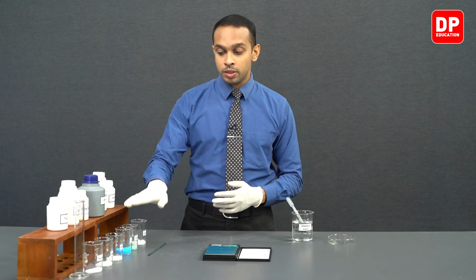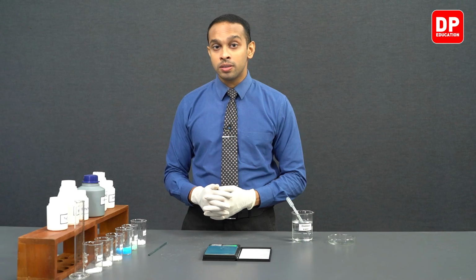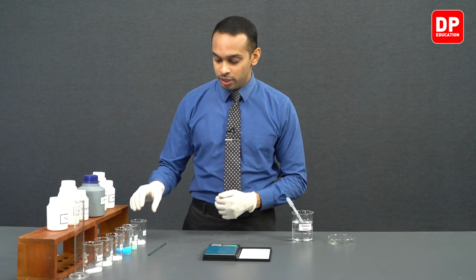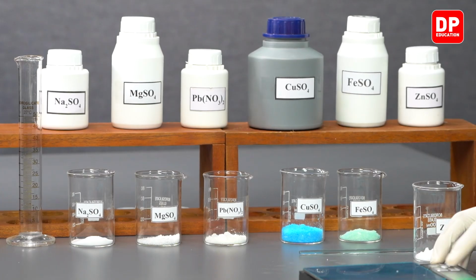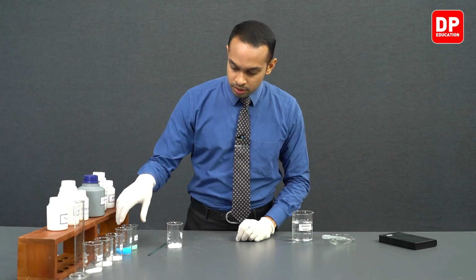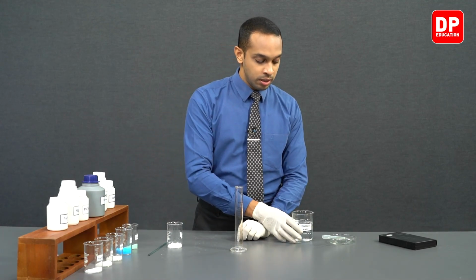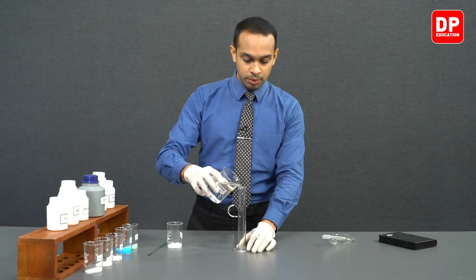So these mass measurements were taken to prepare 50 milliliters of the solution. So we need to measure 50 milliliters of water, and then we need to add that water into each of these beakers. So let's proceed to do that. So we have our zinc sulfate over here, and we have a beaker filled with distilled water, and we have a measuring cylinder that could read up to 50 milliliters. So we are going to add 50 milliliters of water.